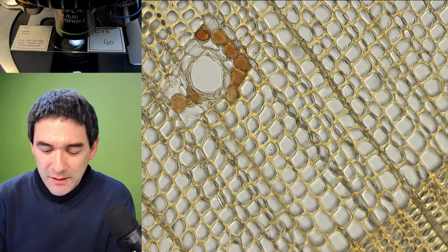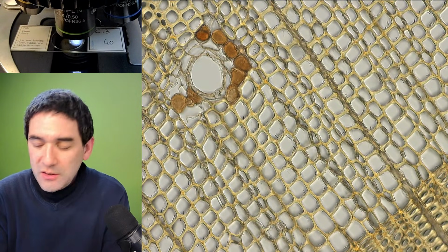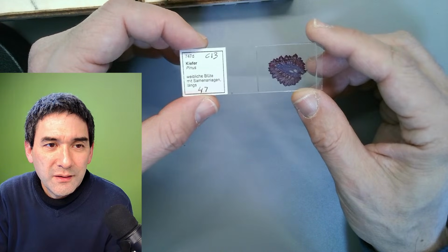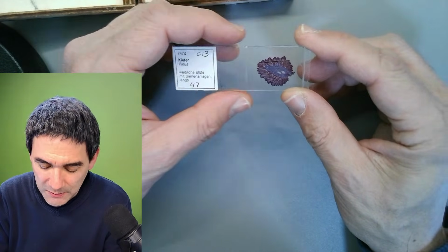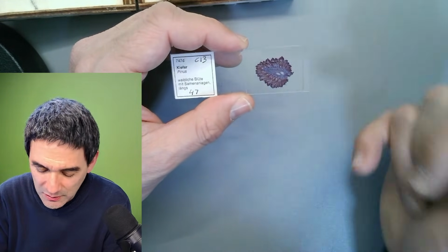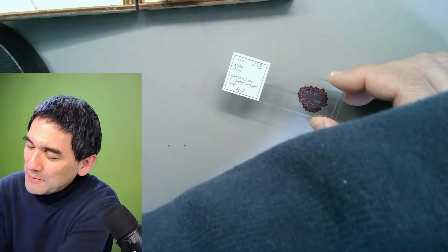Okay. And maybe one of the last slides I want to show you. This is a huge one, and honestly, making this. Look at this here. That's the female flower of a pine. It looks very beautiful too, and the complexity of nature really can be seen here. This is also one where I've taken a picture and put it up on my living room wall.